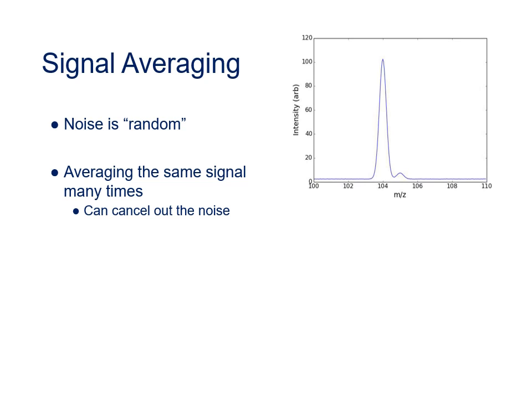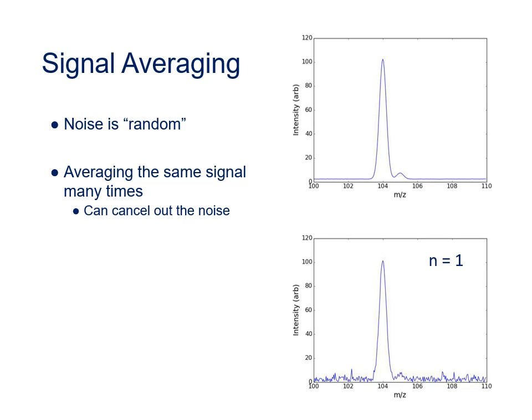Take this spectrum on the right. This is an example mass spectrum showing two peaks with no noise. Now, let's assume that I record a single mass spectrum of this signal. Here we can see the larger peak is easily visible, but the smaller peak is so obscured by the noise that you couldn't be confident that it was really there.